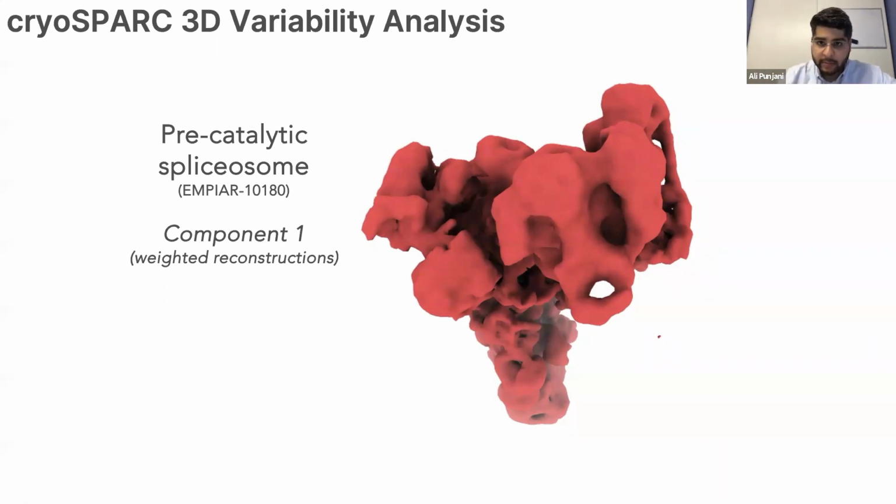So creating masks and doing local refinements is a great next step, but that only works if your particle is big enough to begin with that you could cut it up into pieces and the motion is actually rigid. If those aren't true, then you can't really do too much in terms of improving the resolution yet. I think that's kind of the dream of doing heterogeneous flexible refinement, is that now that we can see the motion, why can't we undo it? So that'll be the next frontier.